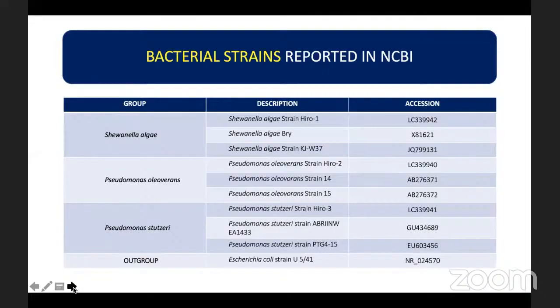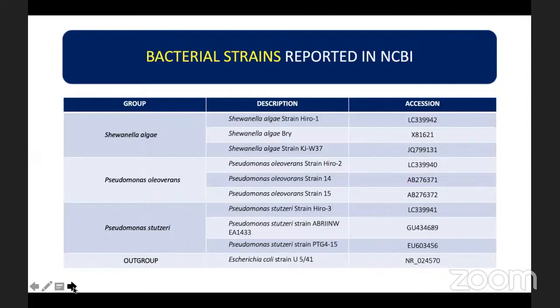For the sample analysis, I will use three different strains from three bacterial species and include a different strain as an outgroup. The three bacterial species are Shewanella algae, Pseudomonas oleovorans, and Pseudomonas stutzeri. For the outgroup, I will use Escherichia coli strain U5/41. I will be using the accession numbers of these reported bacterial strains in NCBI for the sample analysis.